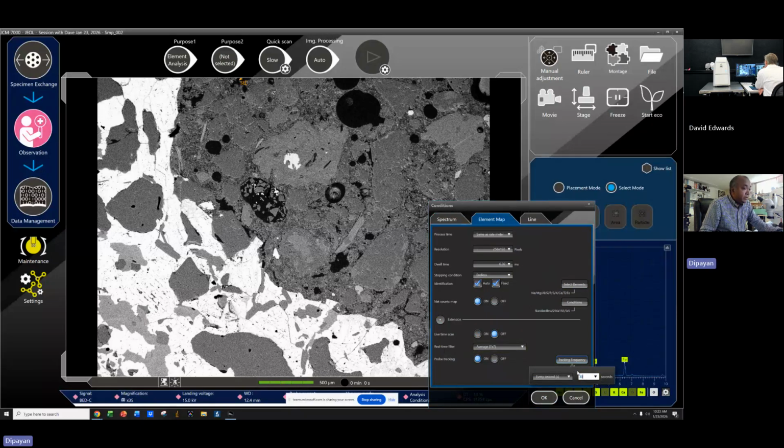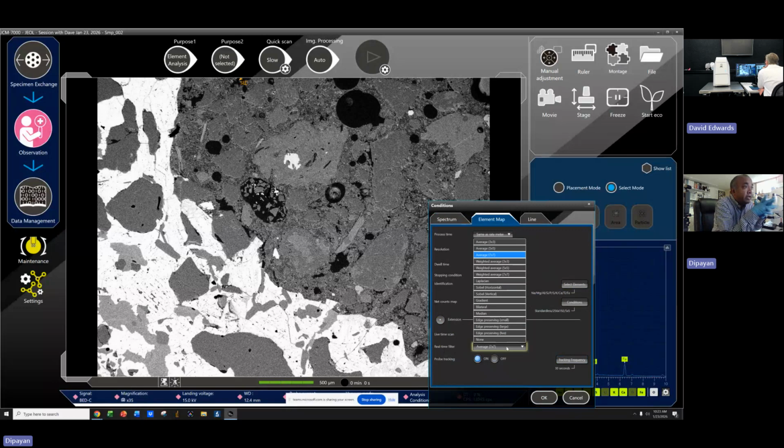And also, was that live time scan? Turn that on. Live time scan, okay. And then the filter is up to you. There's a lot of different filters in there. I usually go to none. I get the sharpest image, but darkest. Sharpest and darkest. But usually I play between average. Weighted average gives a brighter image, but it's not sharper. I do the weighted 3x3.